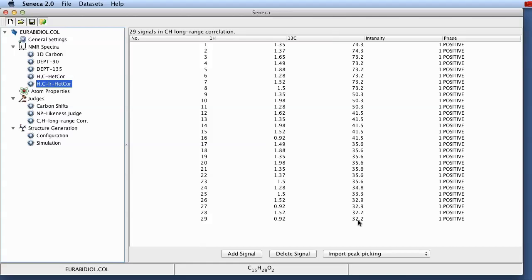And this tells us that this hydrogen and this carbon in the skeleton of the unknown compound are two, three or even more bonds apart. And also here we have an intensity and a phase which again in this case because it was extracted from the literature is all set to one.